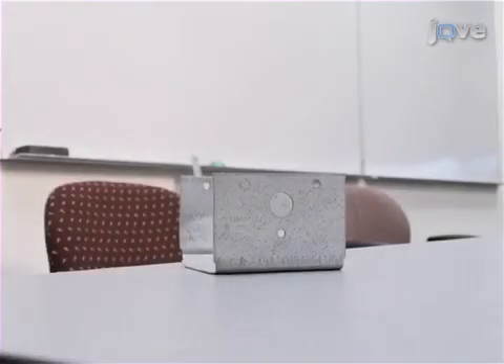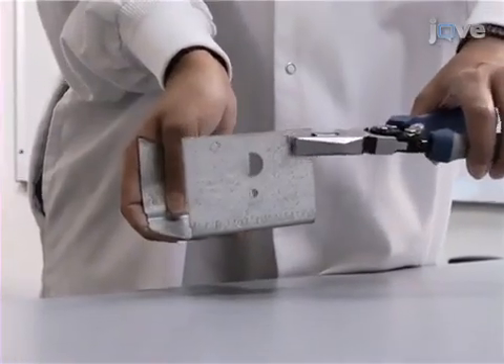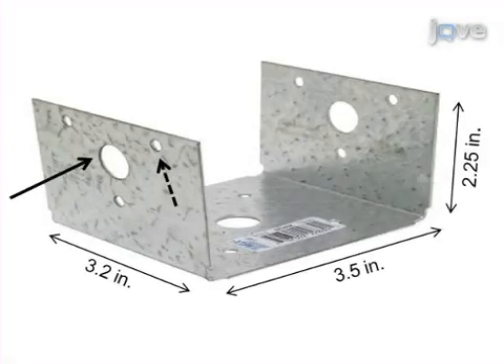To begin assembly of the cryo tolerant device, use pliers to straighten out one side of a three-sided strong tie to make an L-shaped strong tie, as seen here. The dimensions of the strong tie can be selected depending on the diameter of the neck of the DUA.